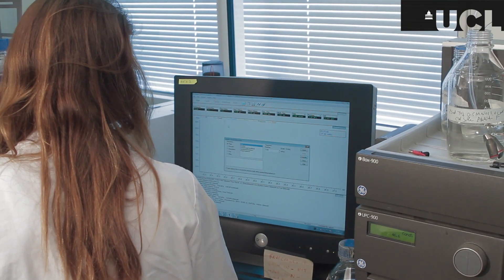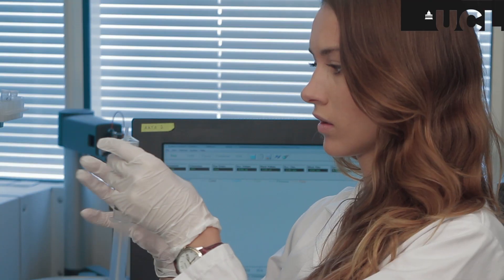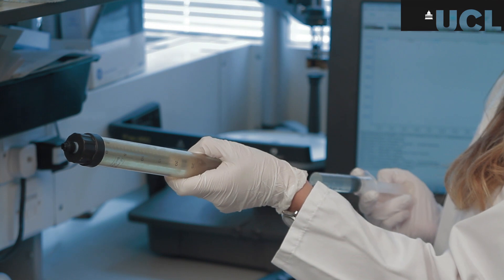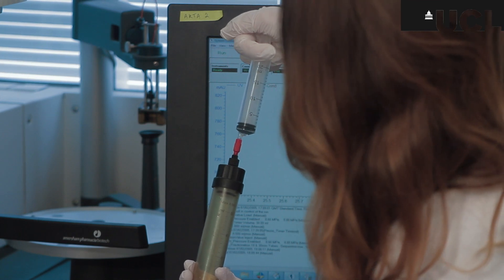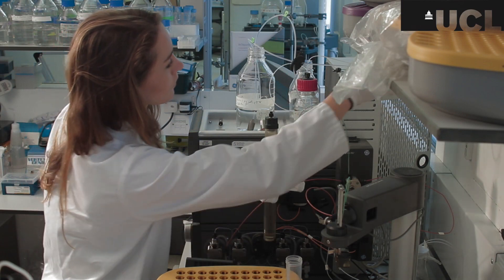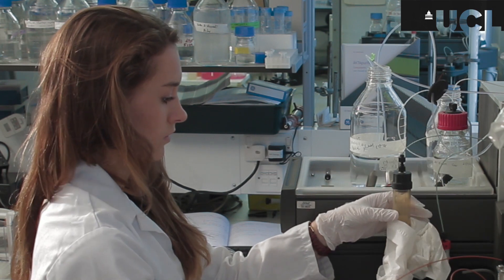We are interested in a recombinant protein which has been expressed in an E. coli expression system. The first step in purification is injecting the bacterial lysate into the superloop. This lysate contains the desired protein that we're trying to isolate. The superloop allows the introduction of large volumes of secondary solutions into a pressurised fluid system. Here I am loading the superloop into the active purification system, and all the wires must be connected properly to ensure that the lysate flows through the column.